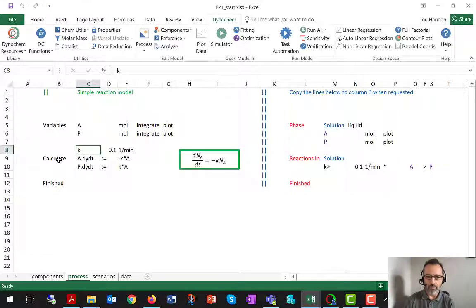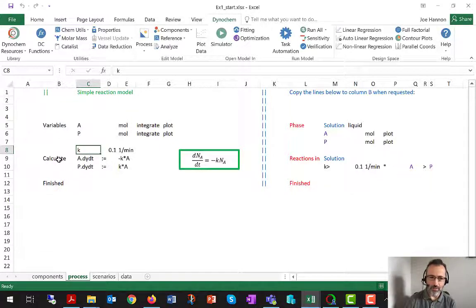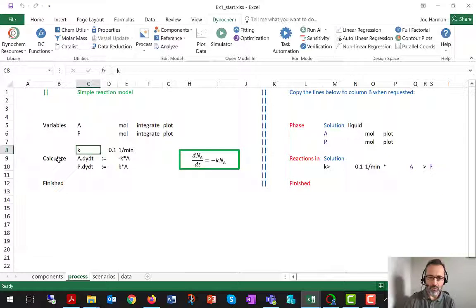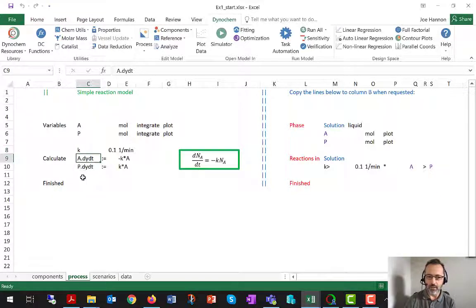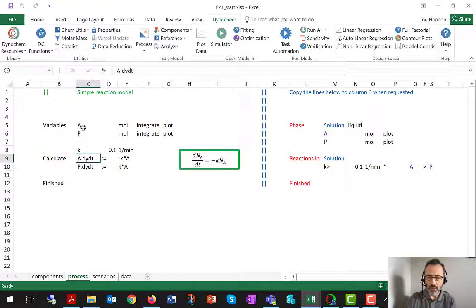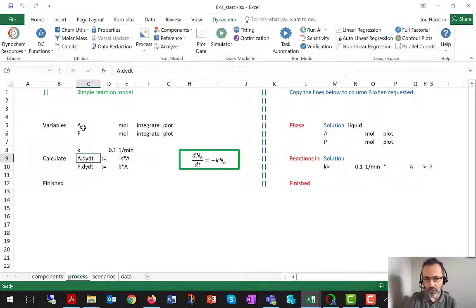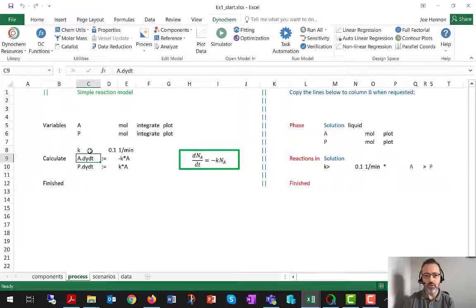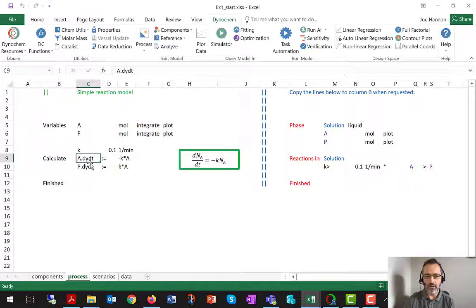Then whenever you have variables, you'll have calculate statements. And the difference here is that these calculate statements, if they're going to be integrated and describing the rate of change of the components, they need to say dot DYDT.